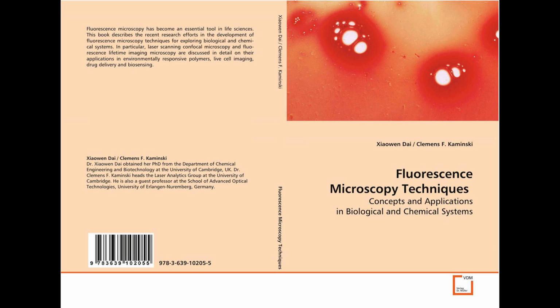Multi-channel PMT systems with 16 to 64 elements have been commercially available, whereas the recently demonstrated CMOS single-photon avalanche diode, SPAD, TCSPC FLIM systems can offer even higher numbers of detection channels and additional low-cost options. Gating method. Pulse excitation is still used in this method.